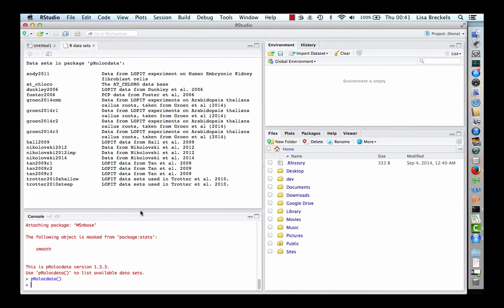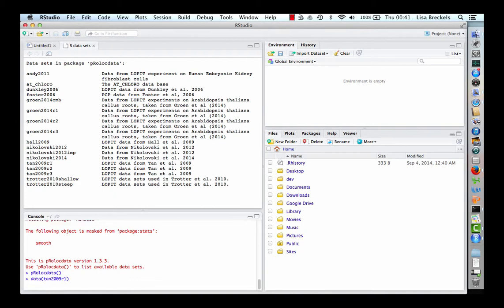To load one of them, type data followed by the dataset name. The dataset is now loaded in the environment, which you can see in the top right-hand pane.